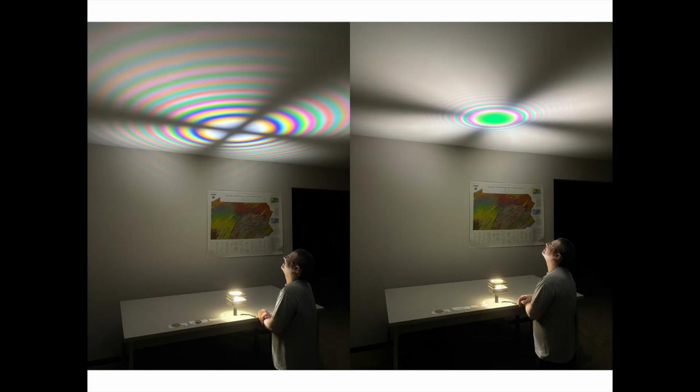The left part of this image shows an optic axis interference figure projected for the uniaxial mineral corundum. The right part of this image shows an optic axis interference figure projected for the uniaxial mineral quartz. The main differences between these two interference figures are actually caused by the optical activity of our quartz.